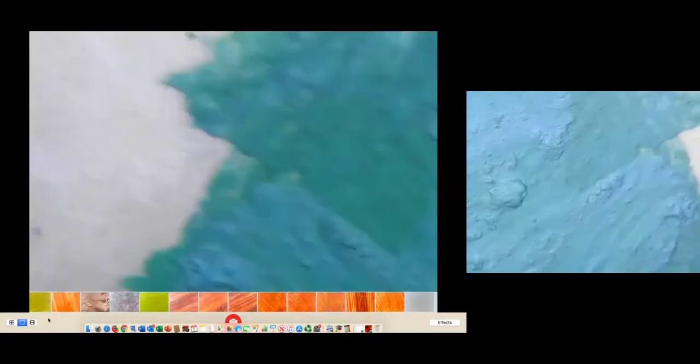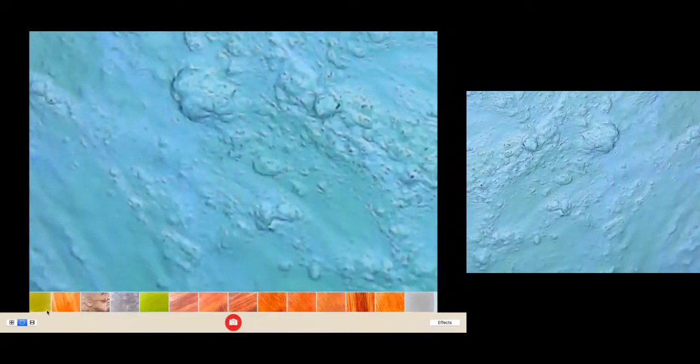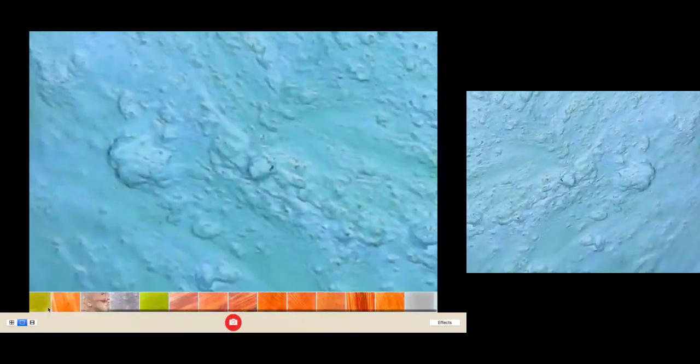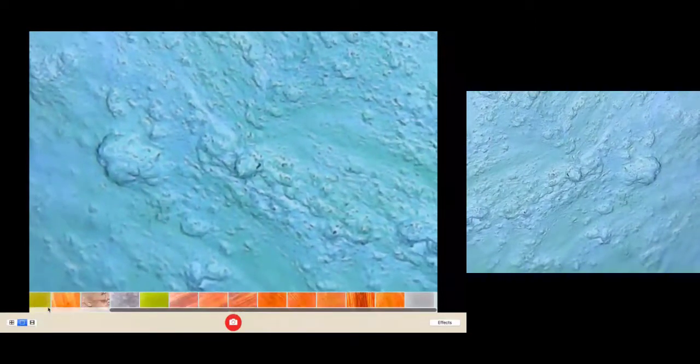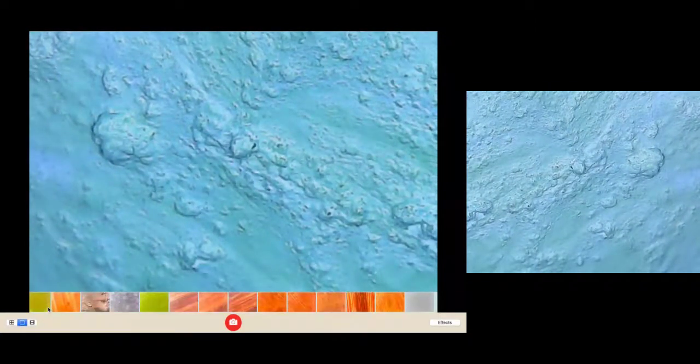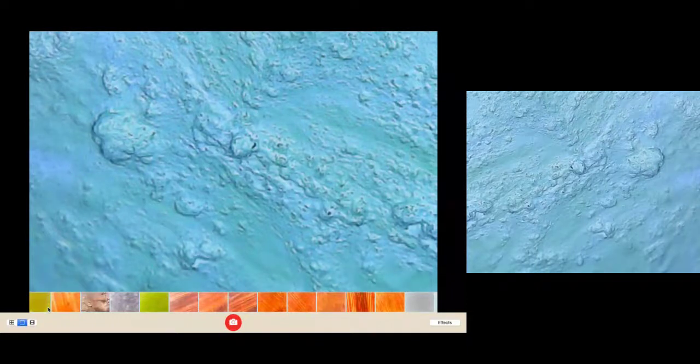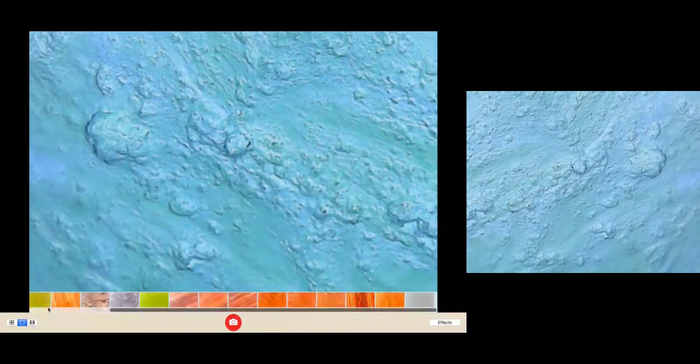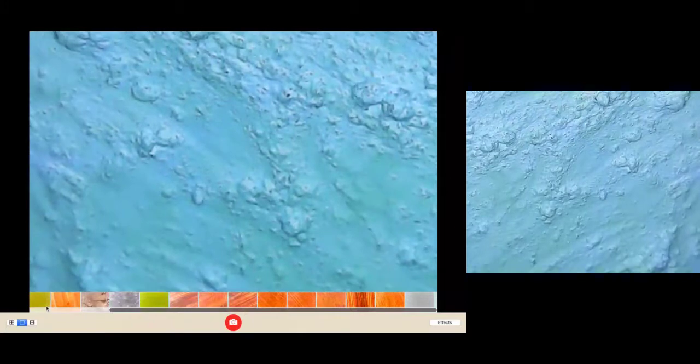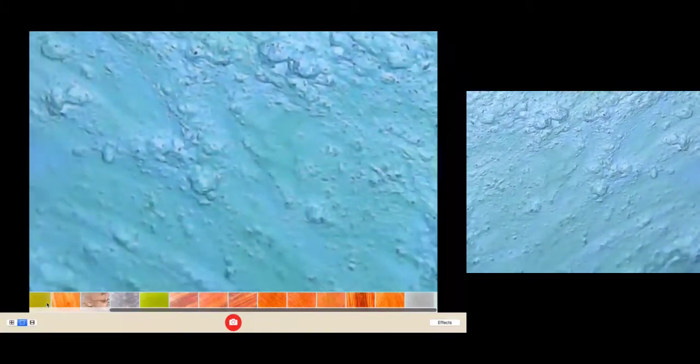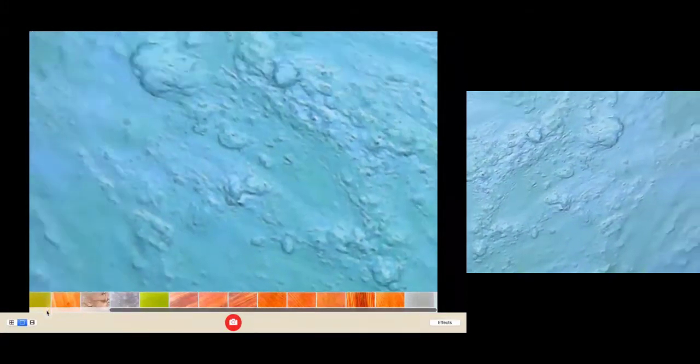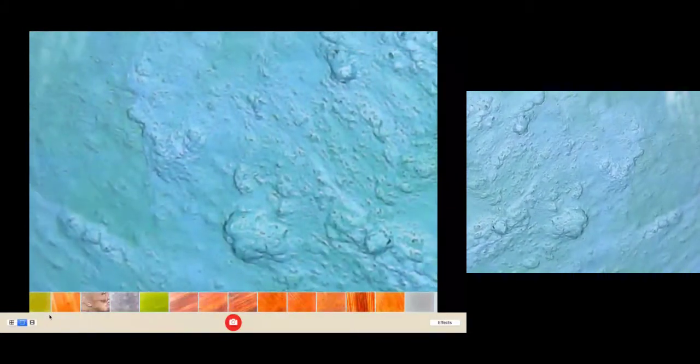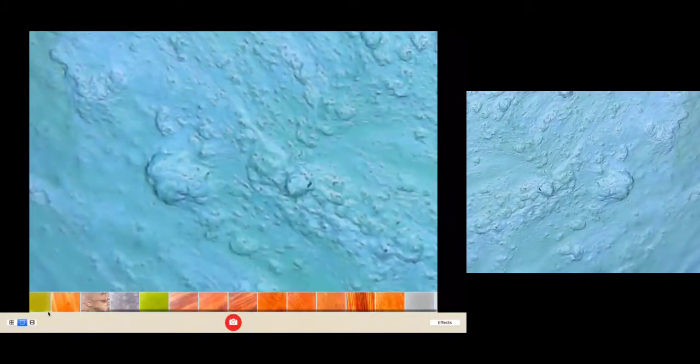Let's take a look at another sample. This is a little bit darker, and there is, with this one, an undercoat of Cray-Pas oil pastel. And then we have the paint formulation applied to the surface, and it almost looks like you're looking at the surface of Mercury or Venus, what have you.